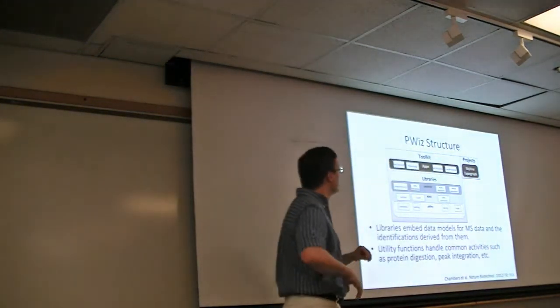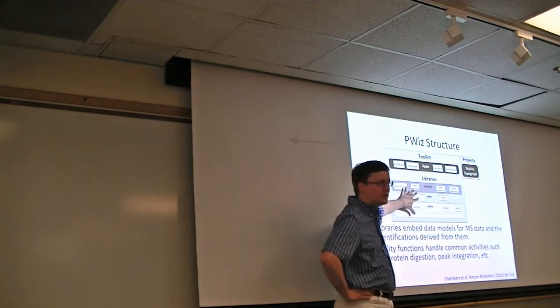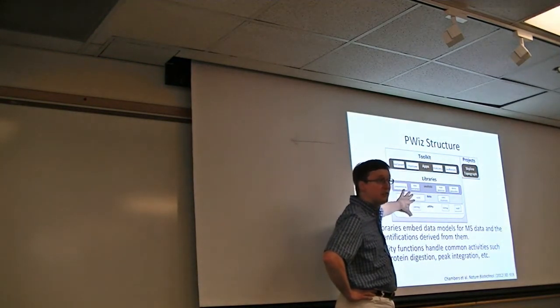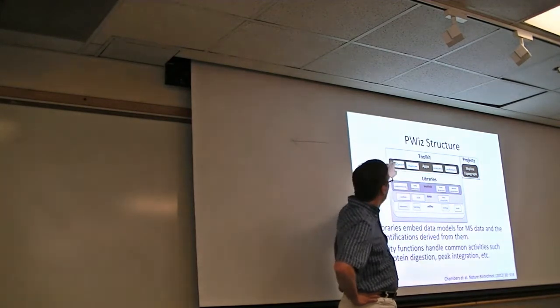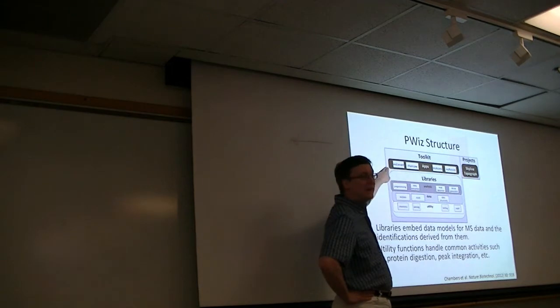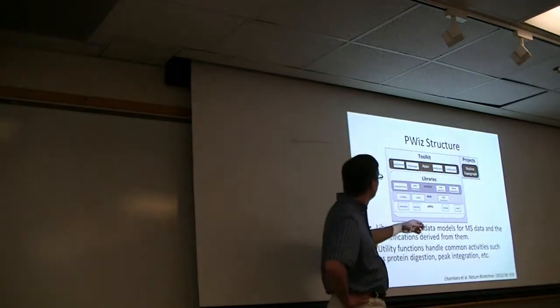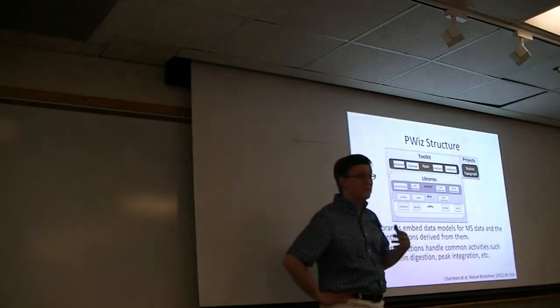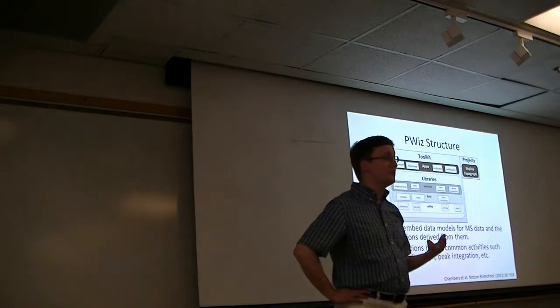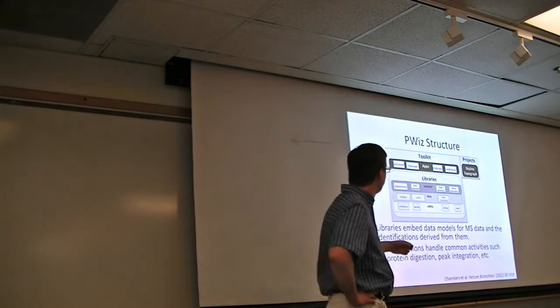Great. Okay, so we have the libraries within ProteoWizard, and these libraries are accessible to software. We have the toolkit, and these toolkits represent binary applications that are part of the main ProteoWizard distribution. So MSConvert is definitely the one that most people have heard of, because MSConvert is the tool that we use to convert from one file format to another.